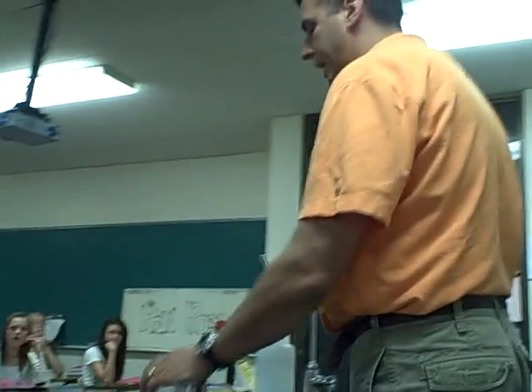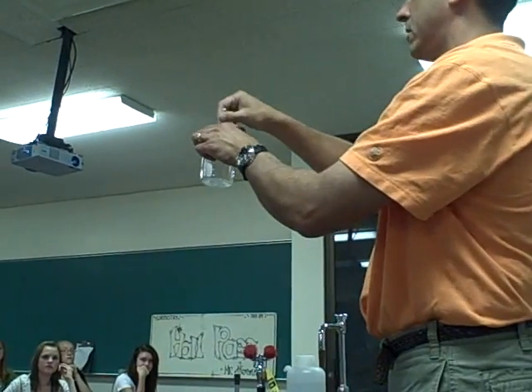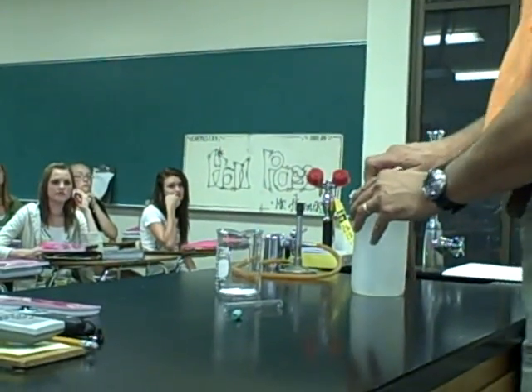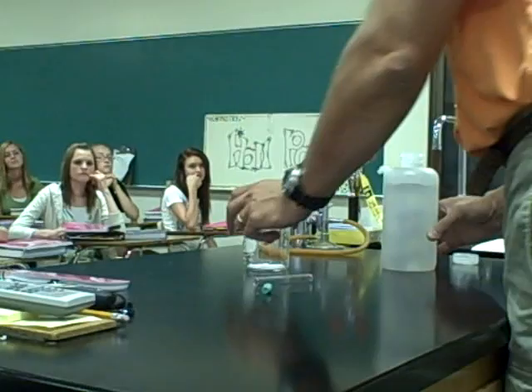I'll take the sodium polyacrylate and put it in this beaker. Once again, that's about a gram, and I will add about three to four hundred grams of water to this, and we'll observe what happens here.